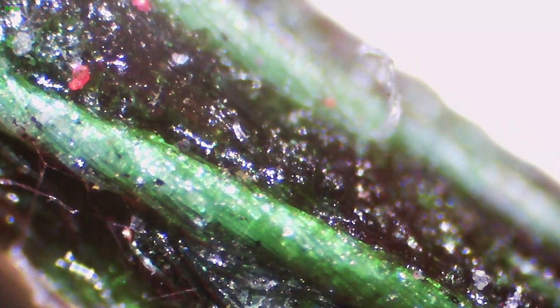I tried to light this fuse under the microscope but it didn't really go as planned. As soon as I lit it, it propelled itself off the slide and just burned things around it. But I did capture the moments right before it lit, and I'll show you what that looks like now.